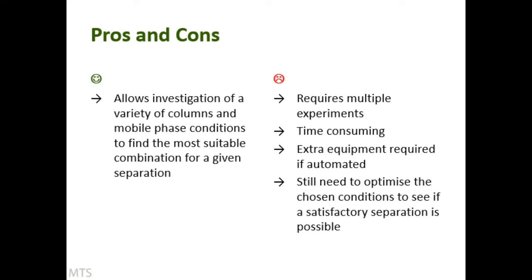So we still then have to take these conditions through and optimize and see, does this work? So we haven't established it will definitely work always at the end of screening. Sometimes we have, if we see all the peaks that we think we're interested in the initial screening. Now, they can be really fortuitous, but doesn't always happen.